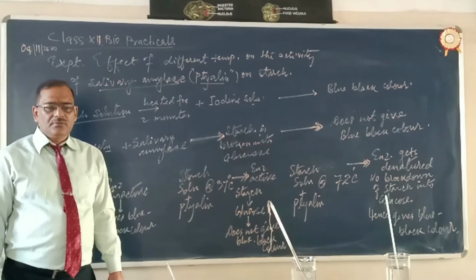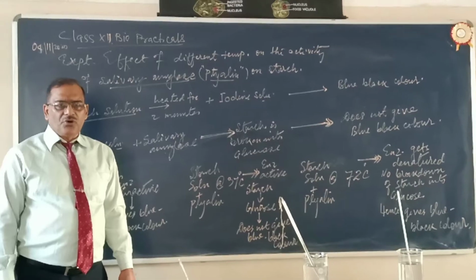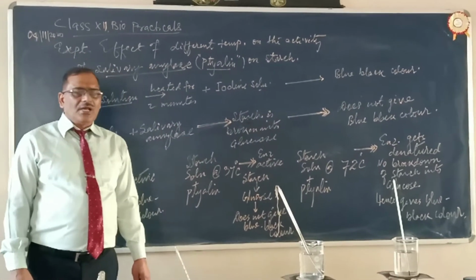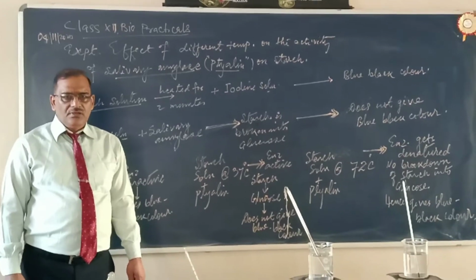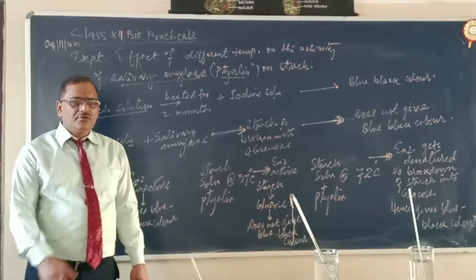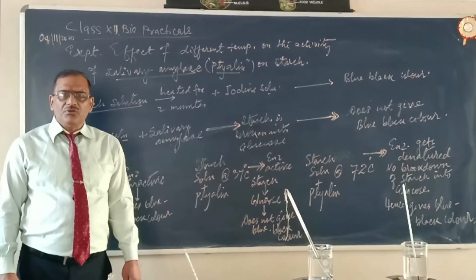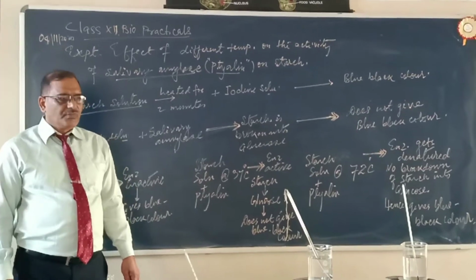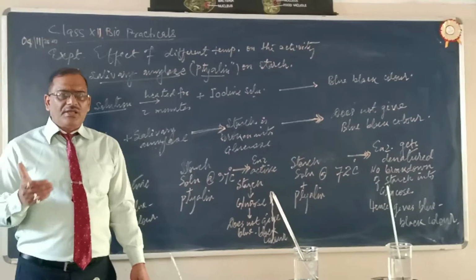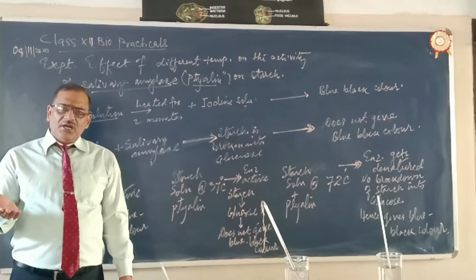thermometers, ice cubes, tripod stand, spirit lamp, thermometers, and the chemical Lugol's iodine or iodine solution. So iodine solution, or Lugol's iodine, is used to test the presence of starch. ठीक है? So what is the test of starch?